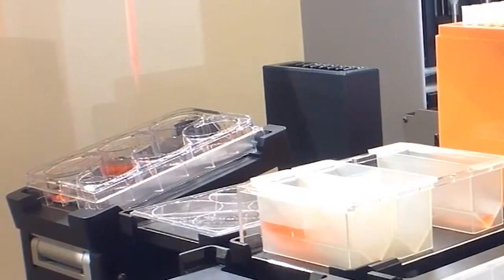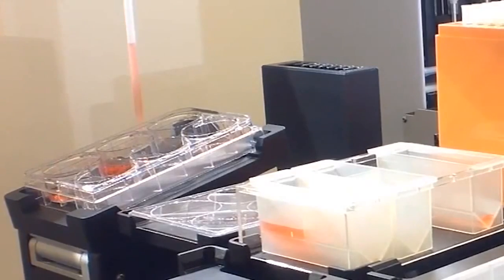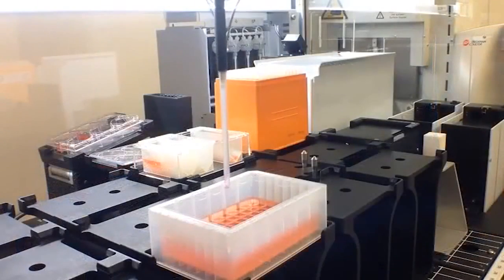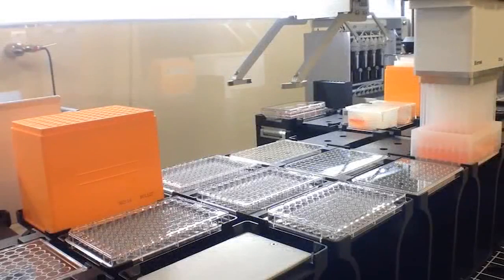In this case, we dispensed 1 million cells into the subsequent well for continuing passages, and a second subset of cells was then added to a large multi-channel reservoir containing 100 mils of media. One of the advantages of the large capacity multi-channel head is that we are now able to completely mix these large volume reservoirs and ensure the cells were evenly distributed throughout the reservoir.